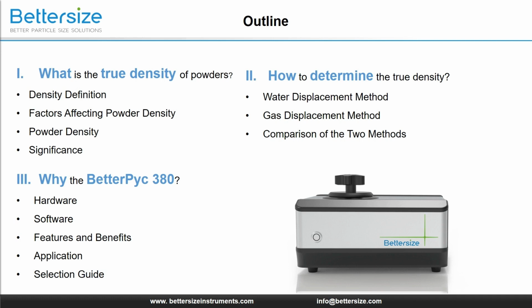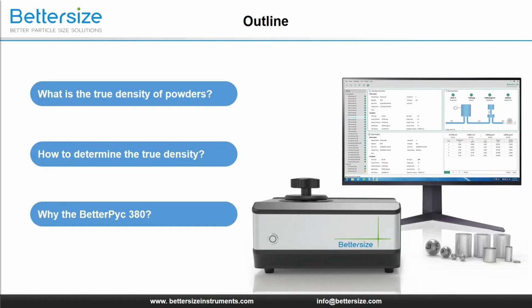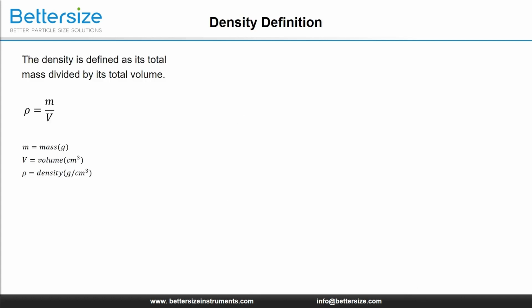Now, let us start with the first part. What is the true density of powders? Before answering the problem, I would like to discuss the concept of density. As we all know, density is defined as its total mass divided by its total volume.